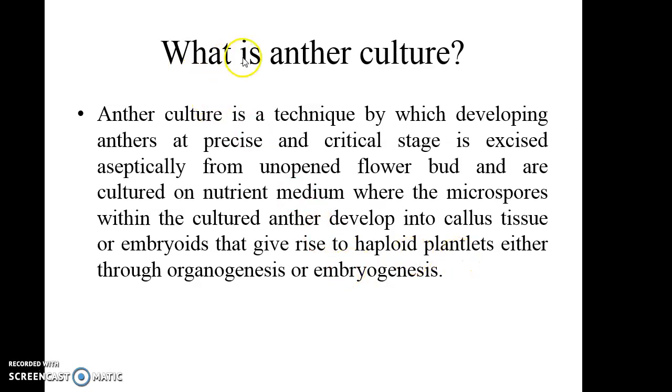So now you can define anther culture. Anther culture is a technique by which developing anthers at a precise and critical stage are excised aseptically from an unopened flower bud and cultured on nutrient medium, so that the microspores within the cultured anther will develop into callus tissue or embryoids that will give rise to haploid plantlets, either through organogenesis or embryogenesis.